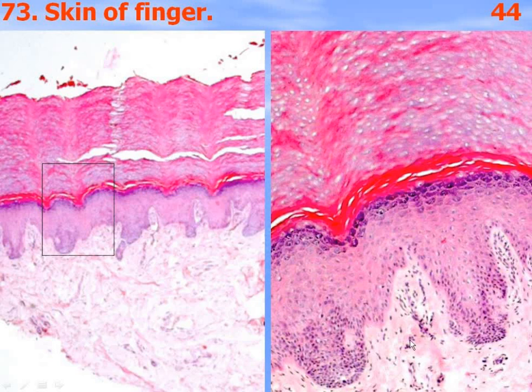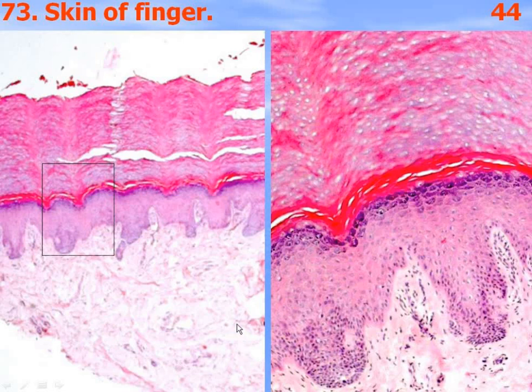Dermis consists of a papillary layer and a reticular layer. The papillary layer is mostly loose connective tissue, and the reticular layer is dense irregular connective tissue.